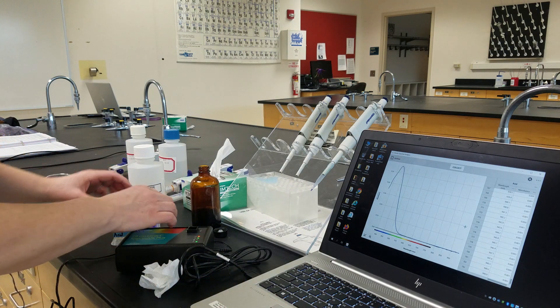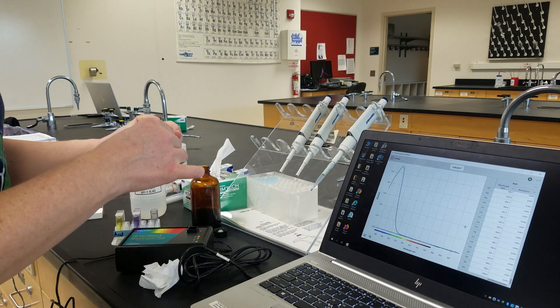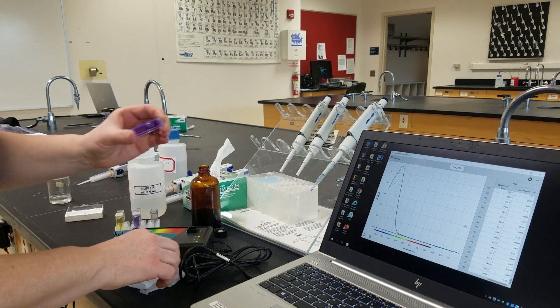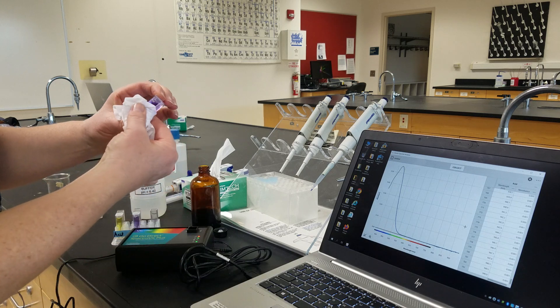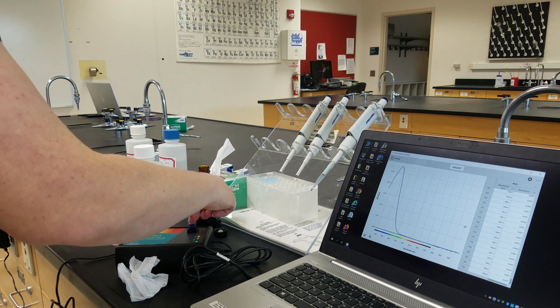One more to go. We're going to take our base, mix it up well, make sure there are no fingerprints, and put it into our spectrophotometer.